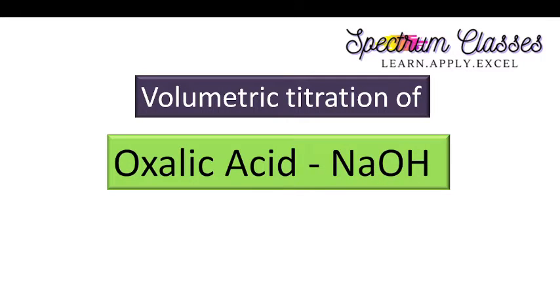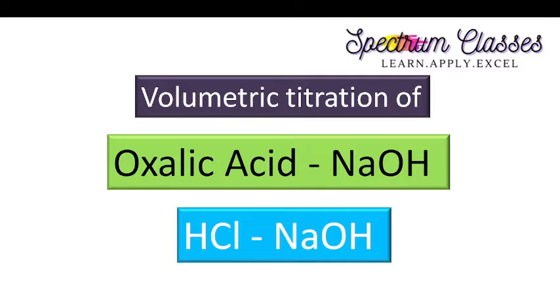In this video, I am going to show you the lab activity related to the volumetric titration of oxalic acid versus NaOH, as well as the lab activity related to HCl versus NaOH. Before starting with the lab activity, I must tell you how to prepare the solutions and how we can do the calculations to prepare the solutions. So let's start with the video.